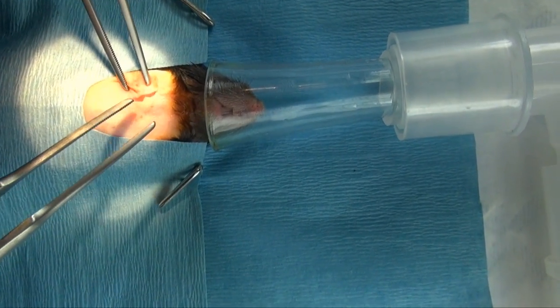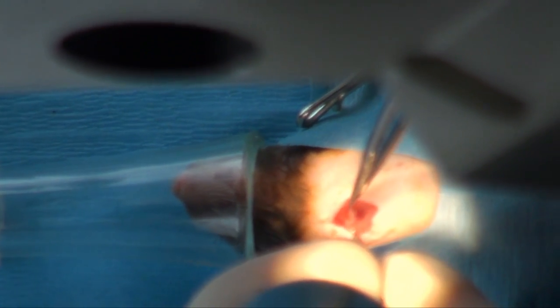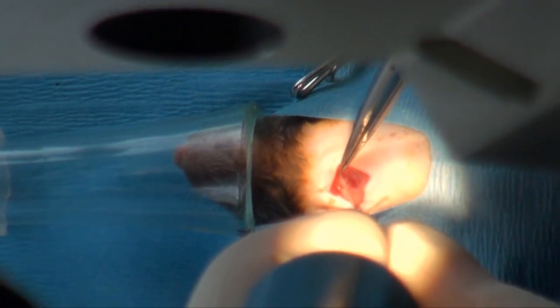Navigate through the planes of tissue by using the blunt dissection technique pictured to expose the right external jugular.